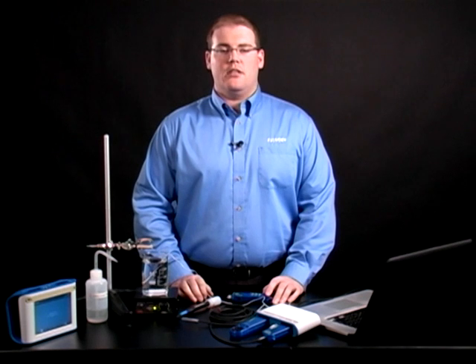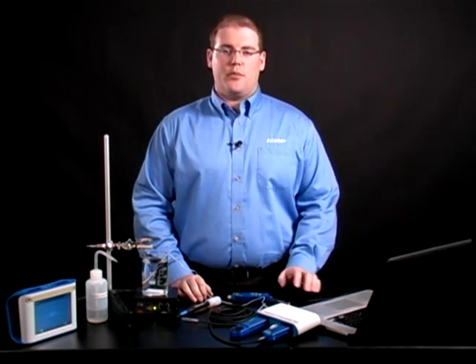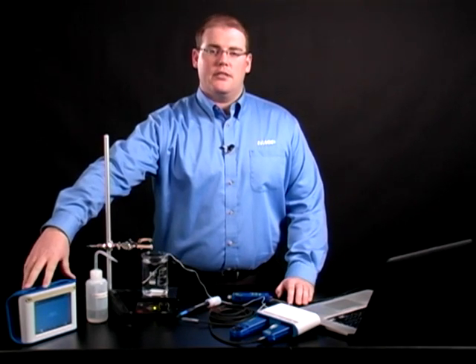Today I'll be showing you how to calibrate the dissolved oxygen sensor in milligrams per liter. I'm going to calibrate using SparkView running on my computer, but you can also calibrate using the Spark Science Learning System.